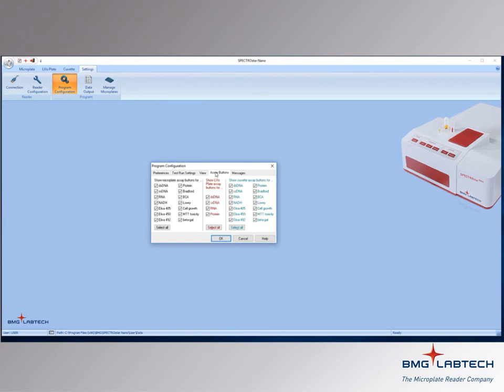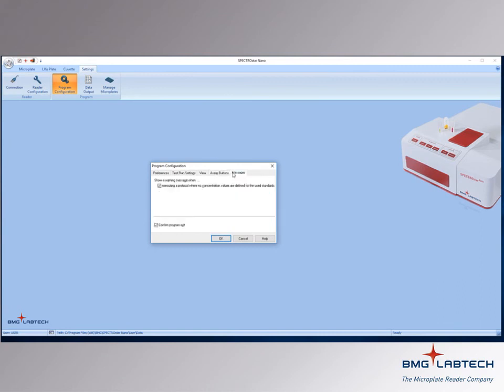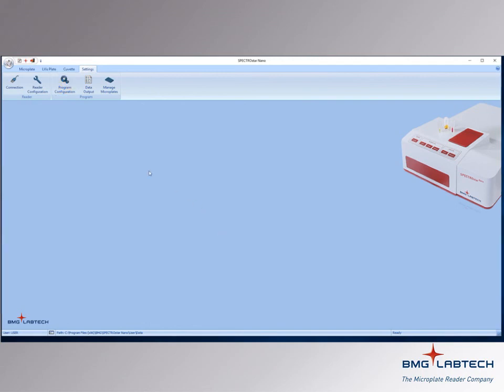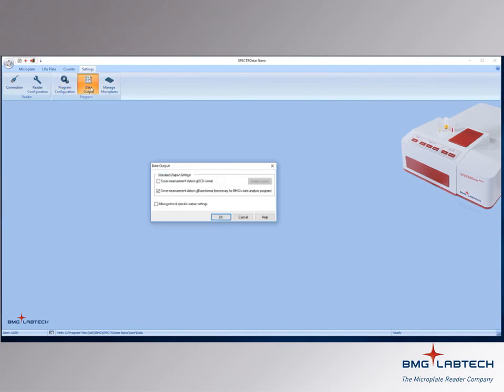Furthermore, you can select which predefined assay buttons will be visible, and whether or not you want to be warned when you have defined standards with no corresponding concentrations. You can also change how your data is saved.